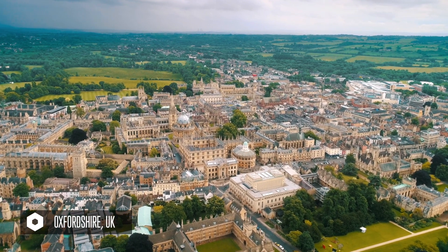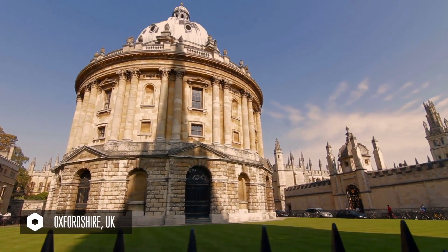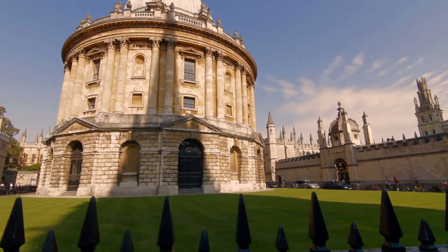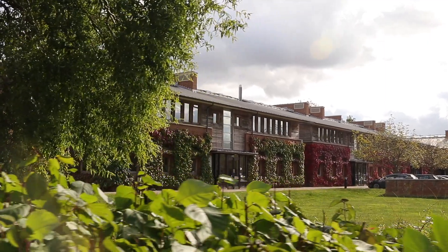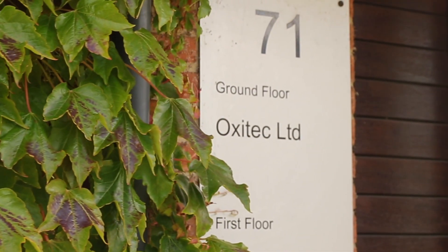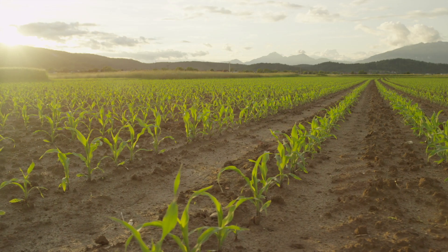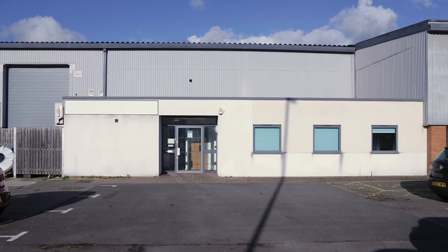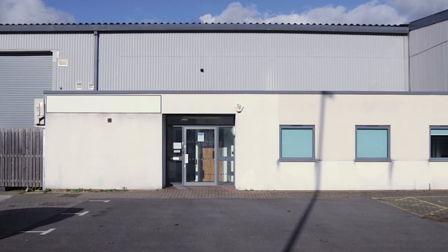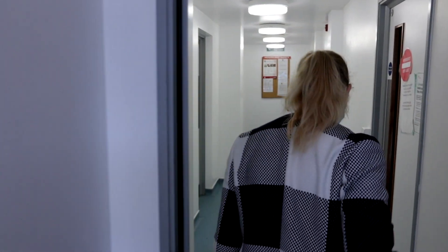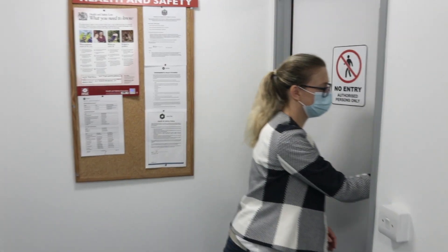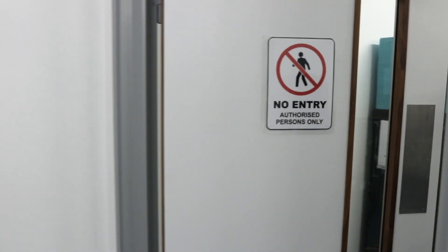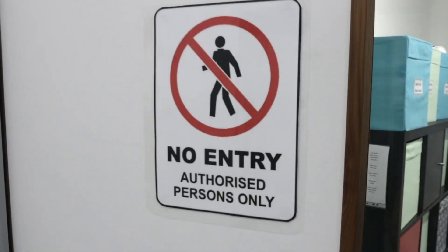Our first stop is England, where Oxitec's story began in 2002 as a spin-out from Oxford University. This is where we operate our headquarters and develop biological solutions to safely and sustainably control insect pests that spread disease and damage crops. Our facilities may look unassuming from the outside, but step inside to find our state-of-the-art innovation center and lab facilities, where Oxitec's team members, representing 15 nationalities, develop Oxitec's technology.